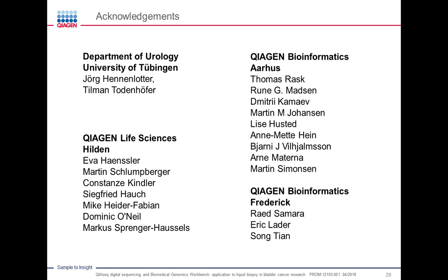So there is a very nice comparison table in one of the handbooks of the QIAseq panels, and it's very important to highlight that the target mean coverage to reach this kind of UMI coverage, depending on the input DNA in your preparation of the library, might be around 25,000x.